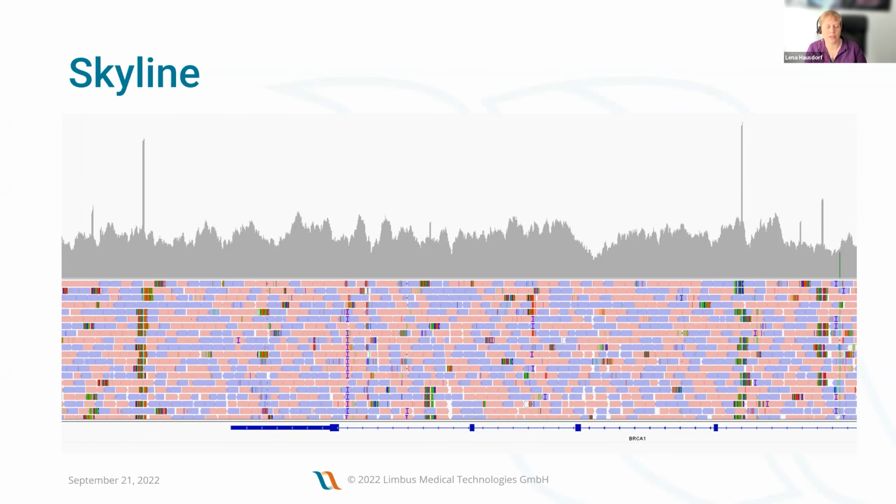But also if you click on any coordinate at any point in our software, you have the ability to open the BAM file of this case in an external IGV application. The cases I will describe will often only be explained if you actually take a look at the BAM file. So this was a normal case.